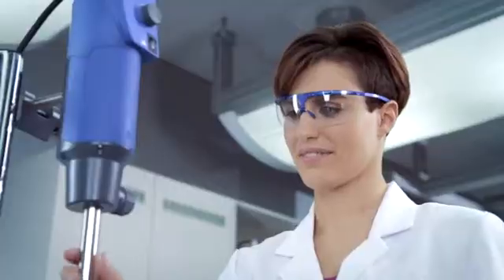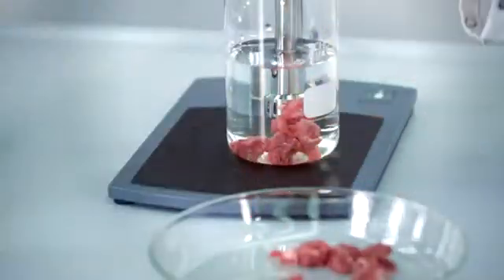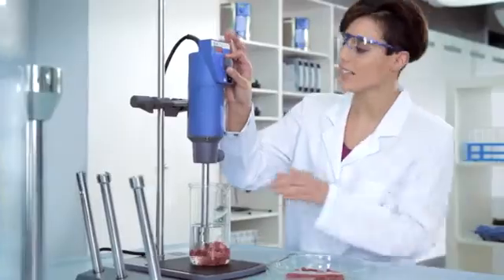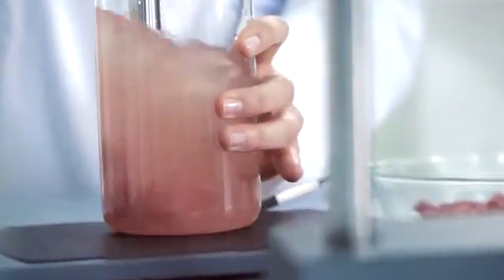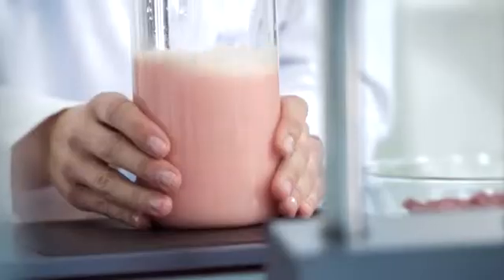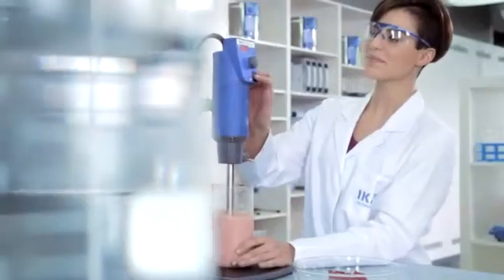New from IKA: our sawtooth dispersing tools for extremely fibrous materials. Designed for cutting and shredding action. The T25 digital can also be integrated into a laboratory reactor system.